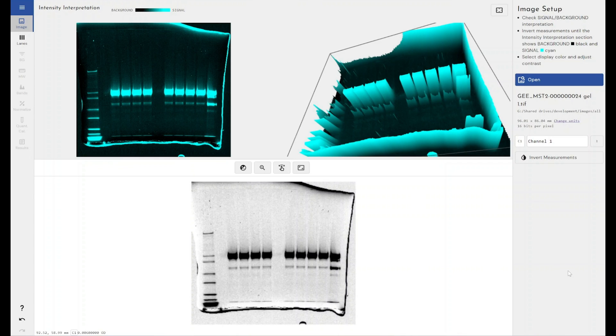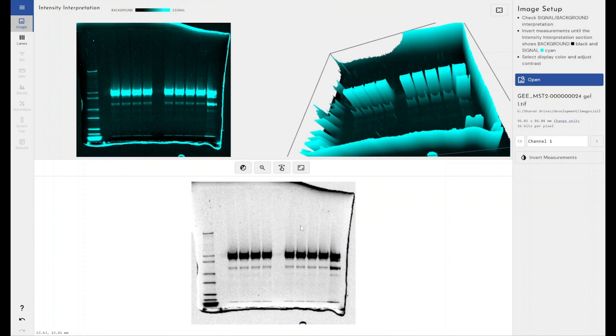The principle being that high molecular weight proteins or longer sequences, higher base pair number of DNA or RNA, will have a harder time moving through your gel and thus will appear higher up within your gel than lower molecular weight or smaller base pair sequences of DNA or RNA.